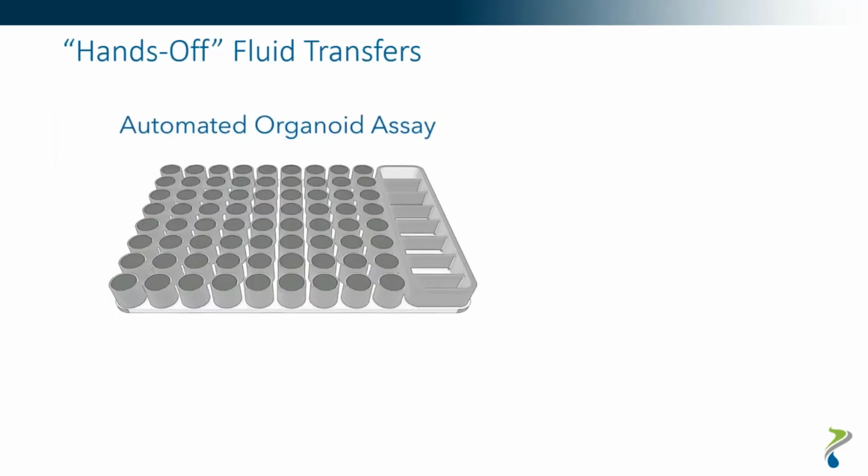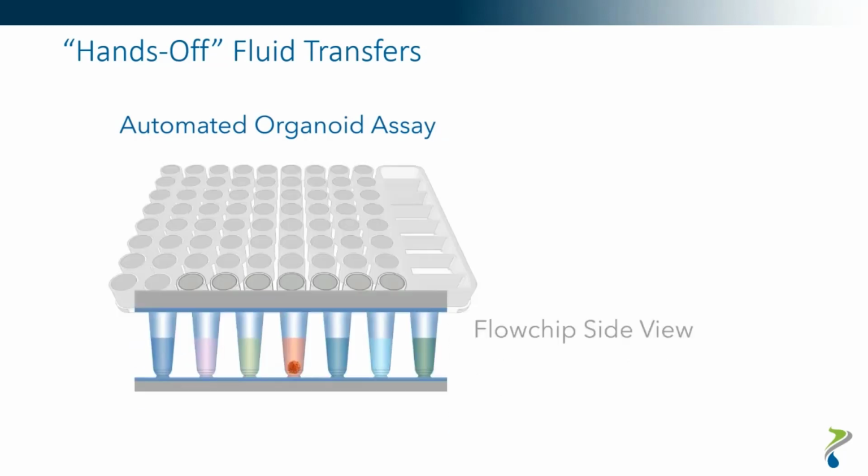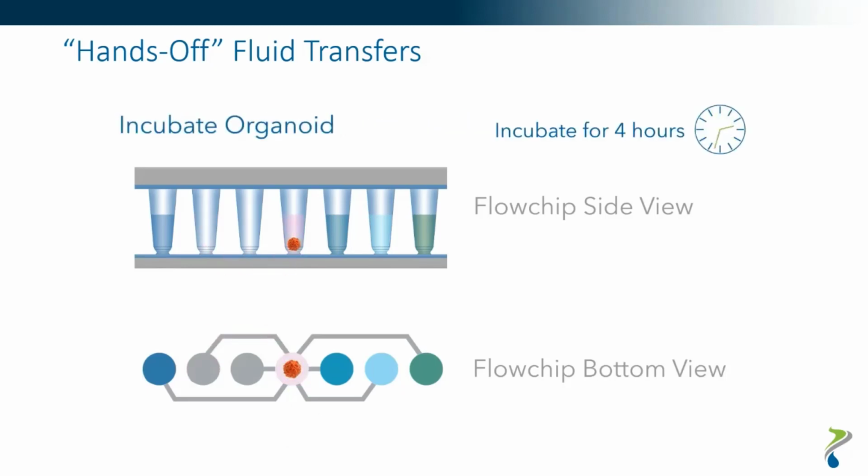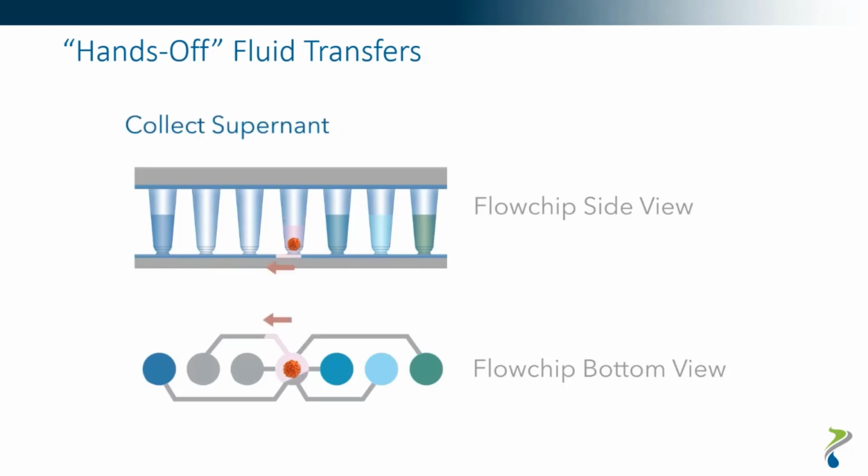So now let's take a closer look at what is happening inside the flow chip during the assay. Here you can see an example of one lane with the sample. We first remove old media to waste, and then transfer fresh media and set the sample to incubation. Then we again drain it out and transfer medium with the compound. Treat your sample with compound for a specific amount of time, collect supernatant that can be used for downstream secreted factor analysis, transfer staining solution, let the sample stain, remove the stain, transfer wash buffer, and stop. So at this point, your assay is completed and the plate is ready to be transferred to the microscope or plate reader, depending on what you're doing.